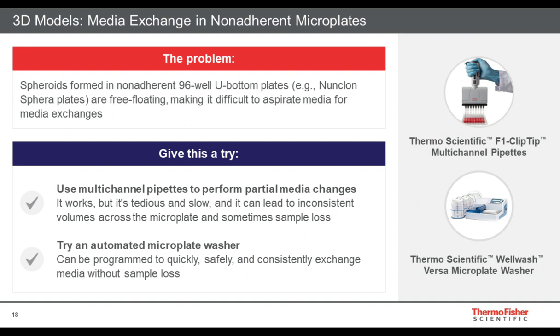However, it still comes with some issues of being consistent and being able to hold a multi-channel pipette level for a fairly long period of time, which sounds trivial, but in practice is not always. And so you can end up with inconsistencies in volume across the plate. So although it is effective, it can be a bit tedious and slow, and it's certainly not without some limitations.